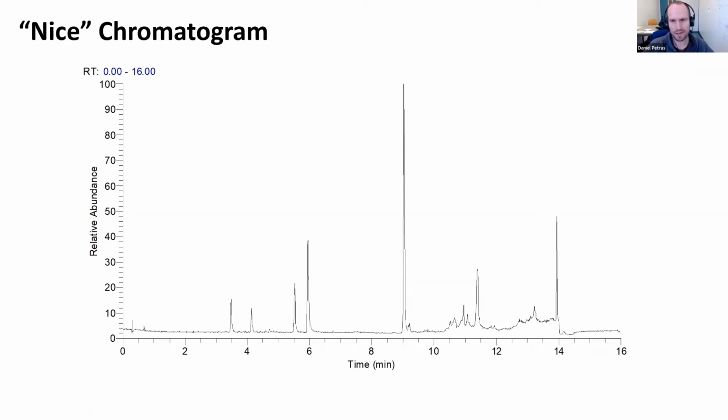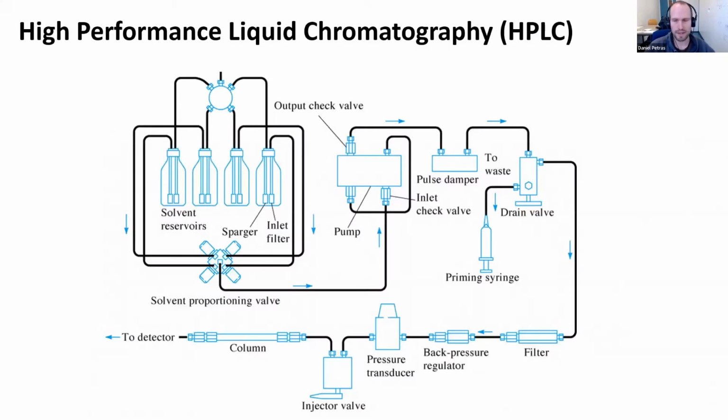And I think in non-targeted metabolomics, where we have potentially 1,000 or tens of thousands of different molecules, the more narrow we make all of them, the more specific and more sensitive our analysis overall is going to be. Just a little technical background.